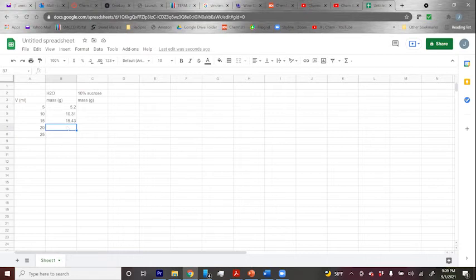Professor, I have a question. After we measure the sucrose, do we put it back in the cup? I don't understand the question. Could you repeat that?